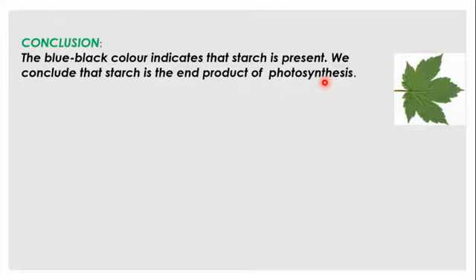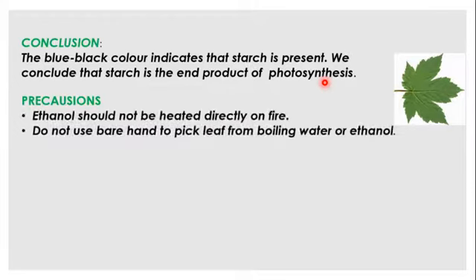There are some precautions you need to take in order to protect yourself and ensure good results. So what are some of the precautions? One, we are saying that ethanol should not be heated directly on fire. As you could see, the ethanol was placed in a boiling tube before placing in the water bath on the fire.